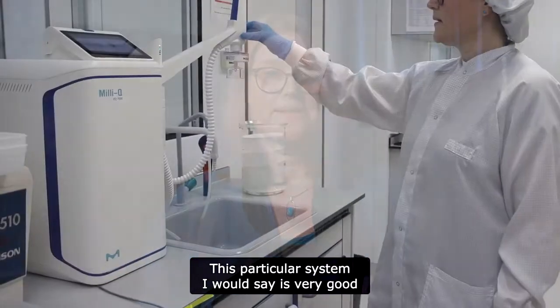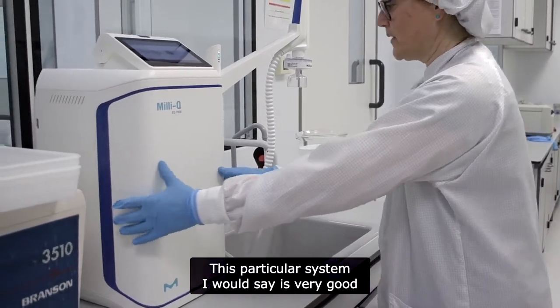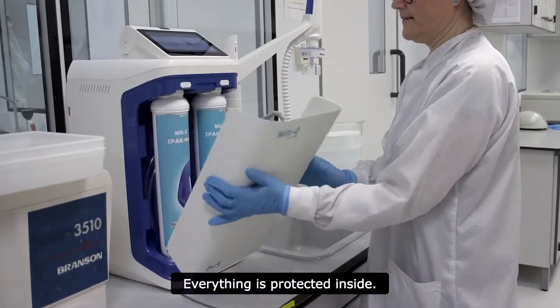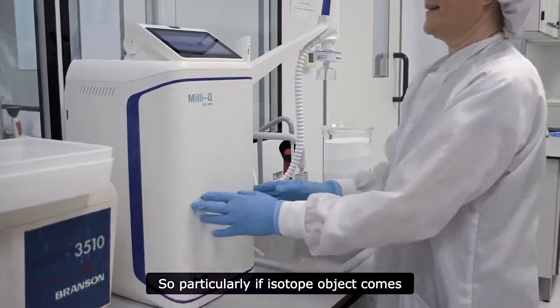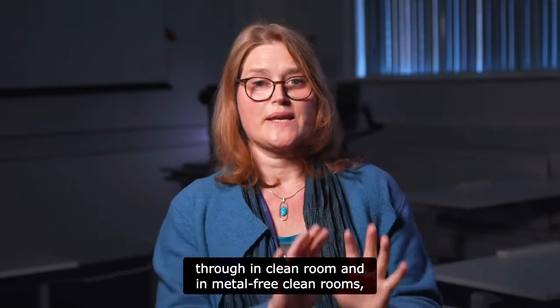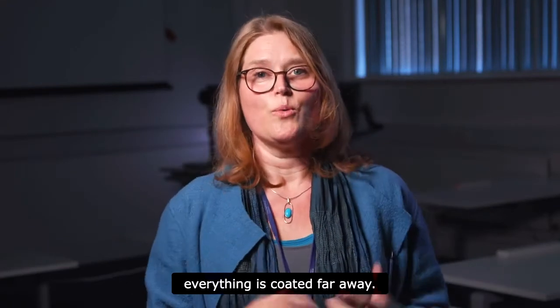This particular system is very good because it's so compact and everything is protected inside. This is particularly useful for isotope geochemists who work in clean rooms and metal-free environments where everything needs to be well contained.